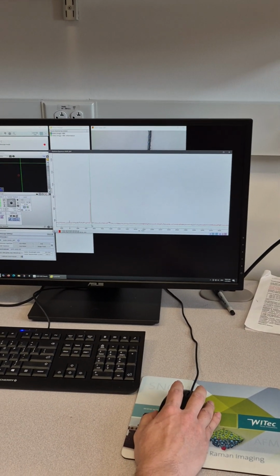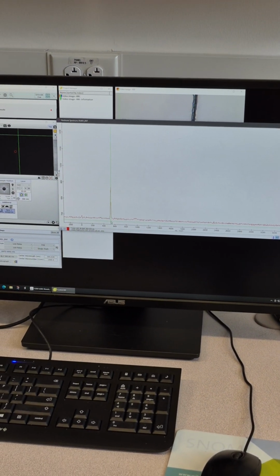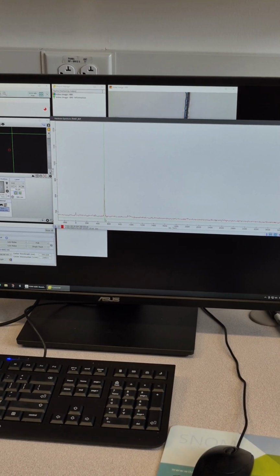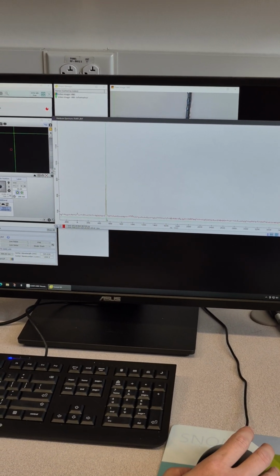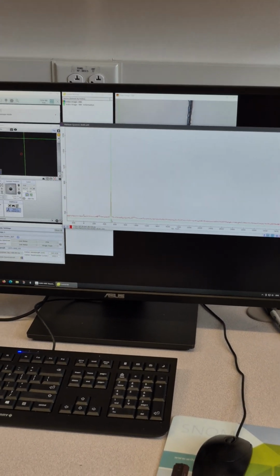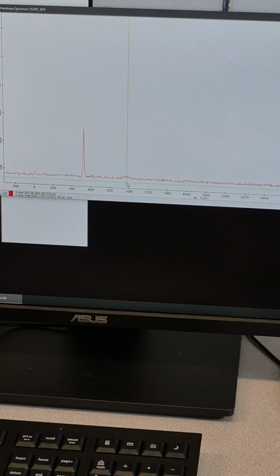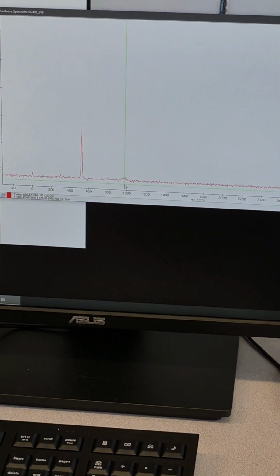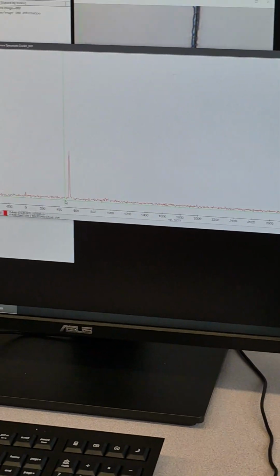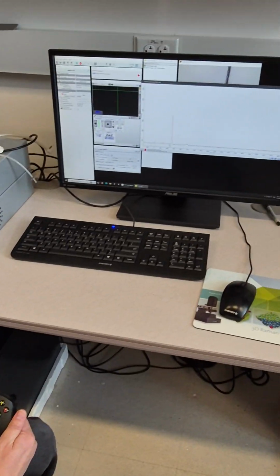For the silicon, it has a silicon bond. The Raman of that bond is at 519 wave number. Very strong signal. And because this is an old sample, the surface is already oxidized a little bit. So you have a silicon oxide peak around 950, which is, you see, very small. Whether this is the best peak or not, we don't know. So I just use focus up and down to maximize my signal.